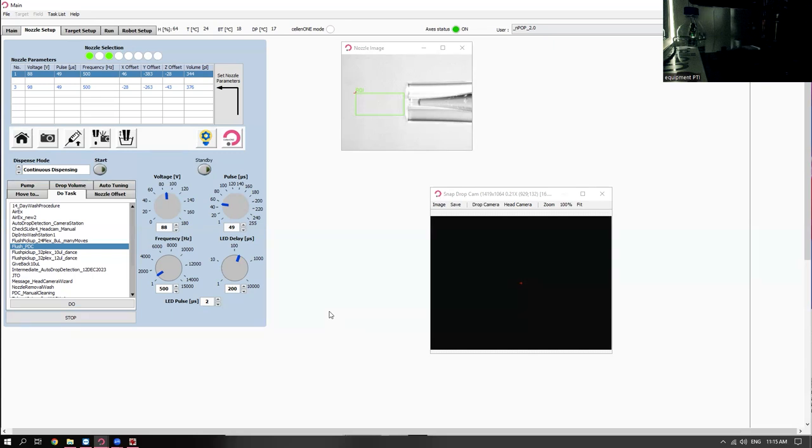Please. The cells I'm also interested in are the parasites which are within the blood cell. The parasites within the red blood cell. I would be able to see them in the transmission because we were doing that. But they are at different stages, and if I have to separate them out, would it be possible, or do I need to have a fluorescent tag on the stage to be able to separate them? Because essentially they're all the same outside, but within that is when the separation happens.